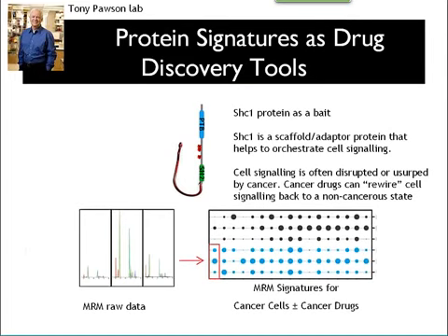Second story involves using protein signatures as drug discovery tools. I'd mentioned MRM at the top. MRM is a traditional technique, and AB Sciex has been involved in it for a very long time. Indeed, their triple quadrupoles have been the dominant design in the marketplace to speed up clinical trials, using triple quadrupoles to do MRM on small molecules and look at bioavailability, basically a phase 3 clinical trial measuring the amount of drug and drug metabolite left in plasma when a patient takes it.